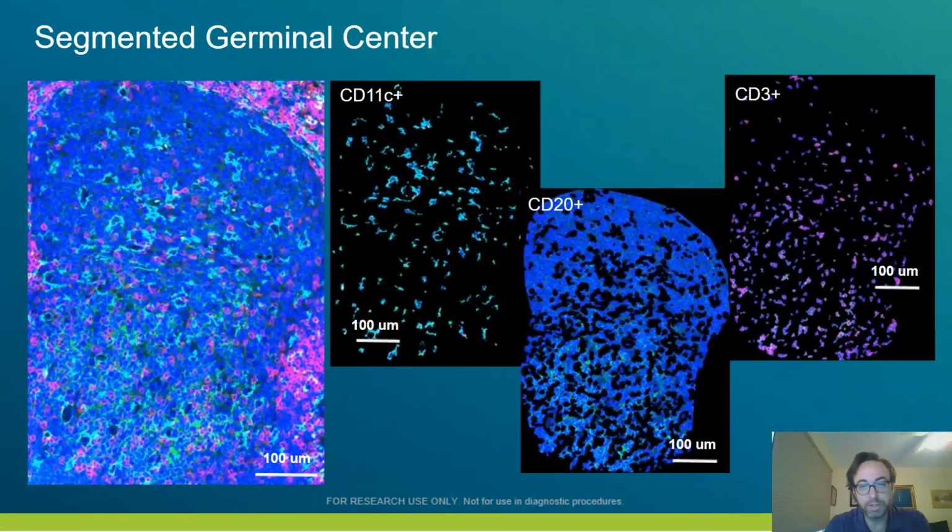And so the combination of these two cell types really helps T cells understand what they should be attacking and what they shouldn't be attacking. The final cell type that we have profiled here is the T cell, which is CD3 positive. So these three cell types are the ones that we're going to focus on here, and we're going to look again for differences that we observe between them and across them.